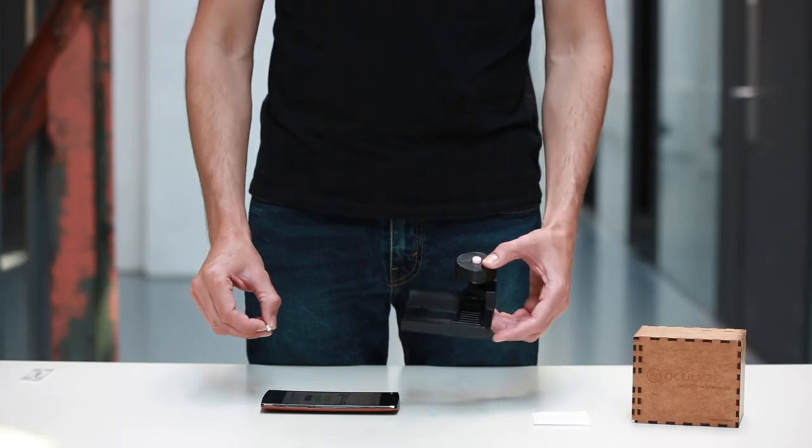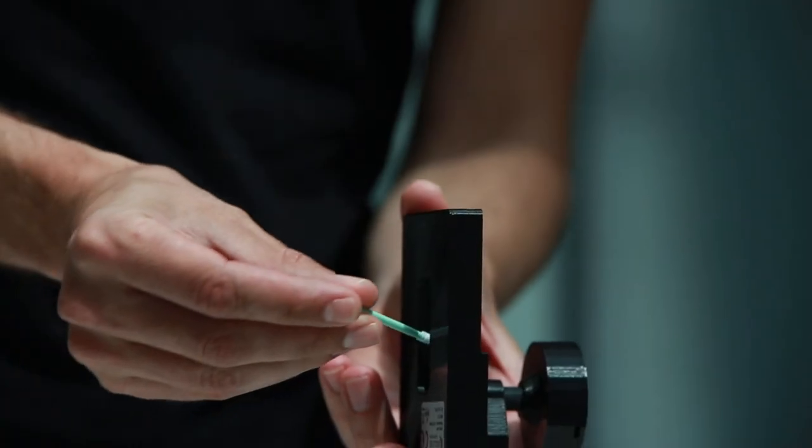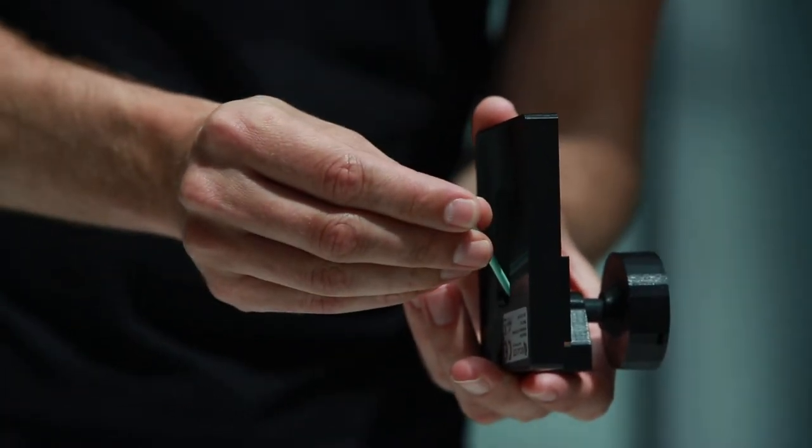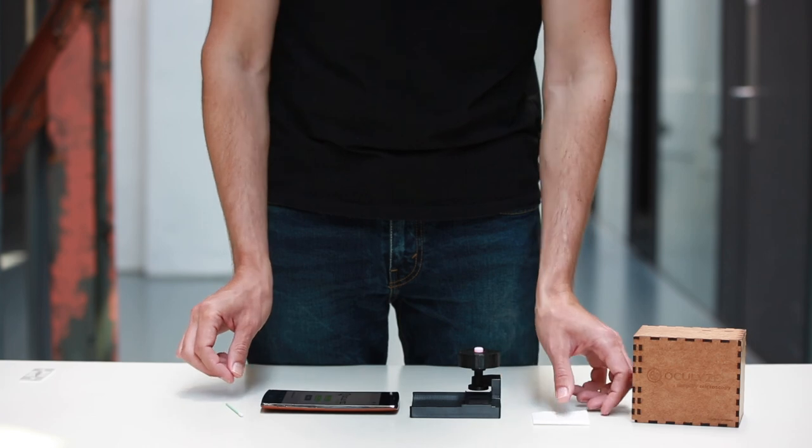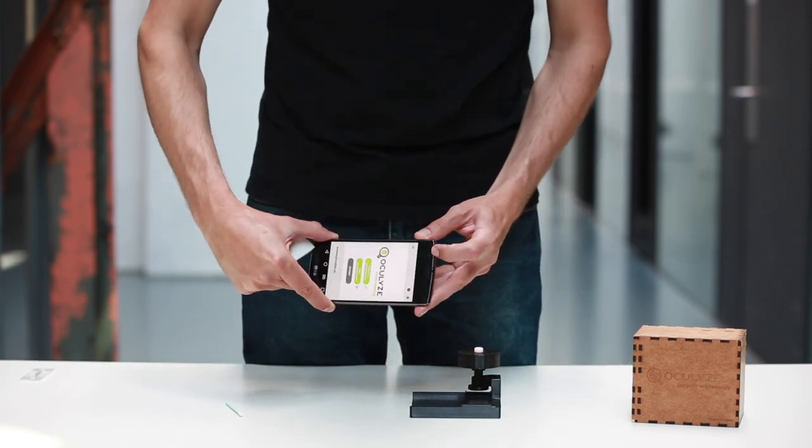To guarantee ideal image quality, the device should be cleaned regularly. Step 1. Clean the optics from the top. Step 2. Clean the optics from the bottom. Step 3. Clean the camera with a cloth.